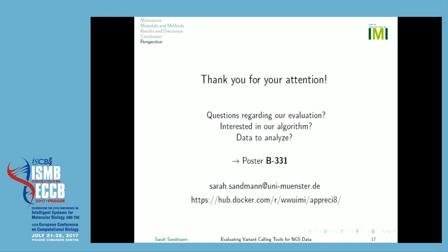Yeah, thank you very much for the presentation. I think it's a very important topic. I would like to pose the question if you observed any change in the results when you altered the parameters, as for instance, the ploidy. The callers you showed, to my knowledge, are germline callers, which expect that you set a certain ploidy.